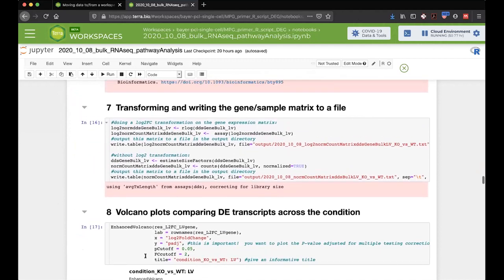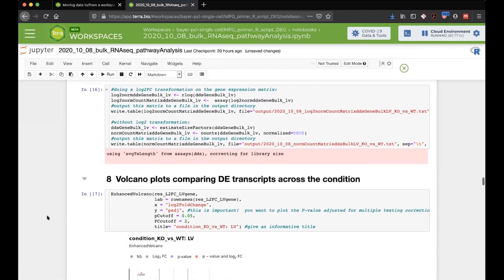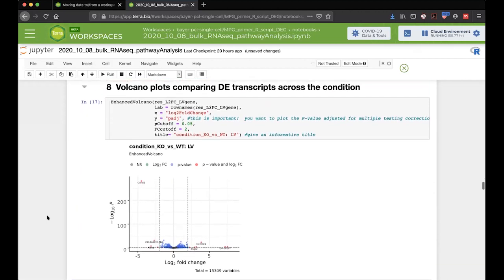I'm not going to show you the plot yet because it's really cool. I found this package and I'll start running it. EnhancedVolcano is really nice. It does automatic labeling, and you do need to be a little bit finicky when you output this file if you want it to retain transparency information for editing in Adobe Illustrator. But I think the data that it outputs is really nice.